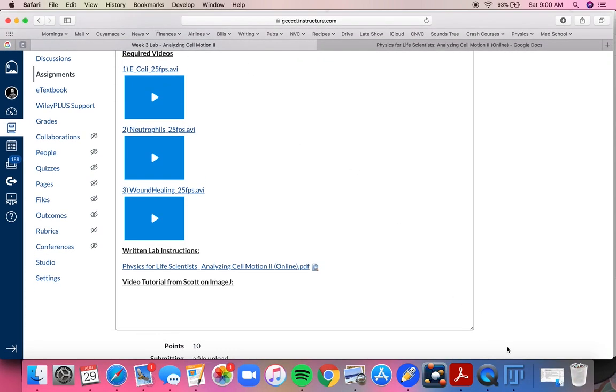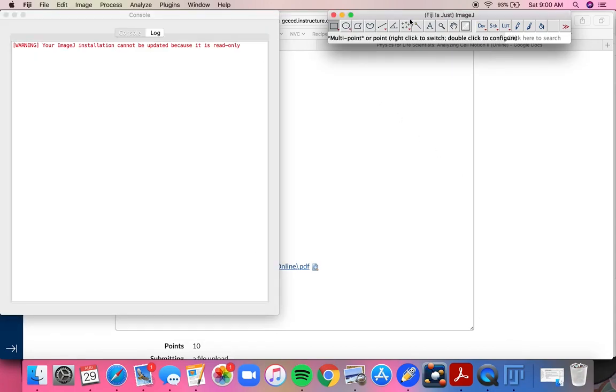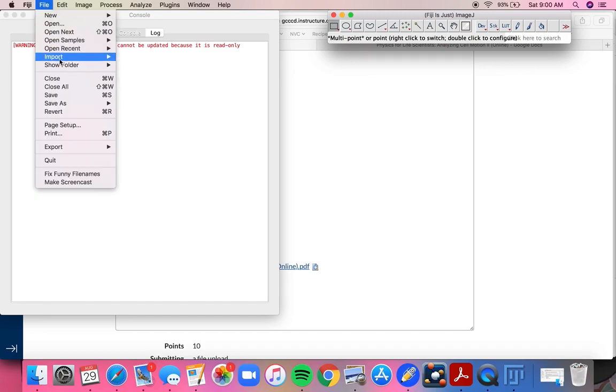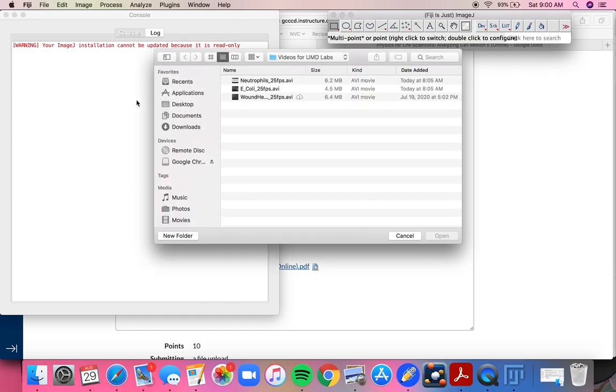And I'm waiting for it. Oh, there you are, Fiji. Okay, cool. So I'm going to click Fiji. I want to click on this guy, right? And then first thing I want to do is go to import, okay? I'm going to import an AVI. So all those files are AVI files, okay? So once you've downloaded and installed, you go there. And now I have my videos for this lab, okay?